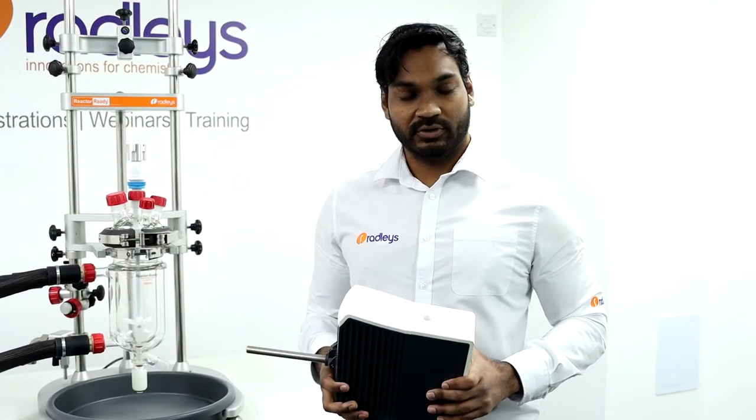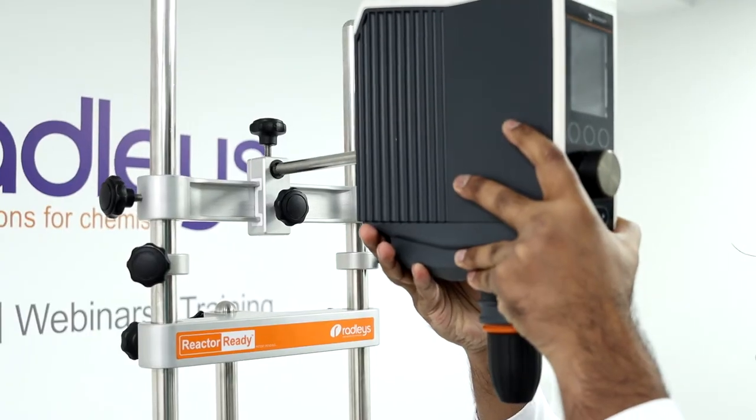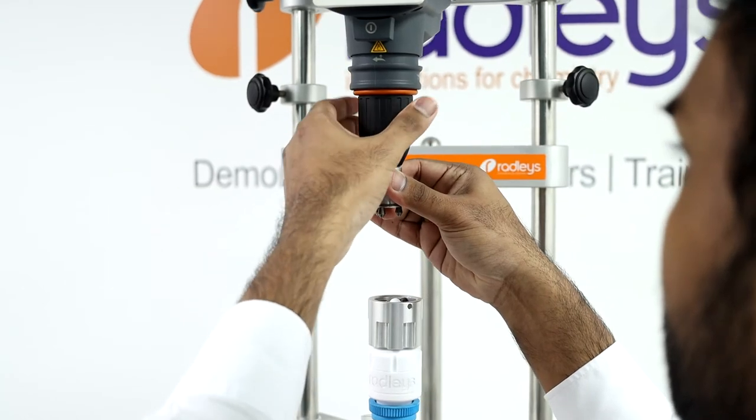Let me show you how to set it up. First you want to insert the support rod of your overhead stirrer into the I-beam. With Reactor Ready you can use any brand of overhead stirrer — today we're using this Hydolf overhead stirrer. Next you want to insert your drop-in coupling into the chuck of the overhead stirrer and secure it.